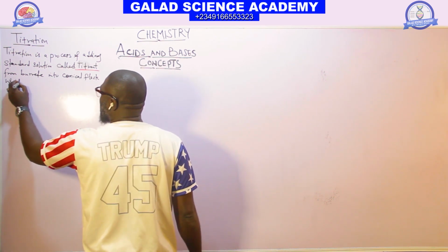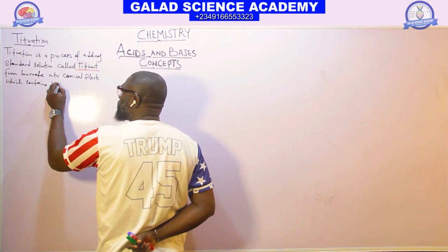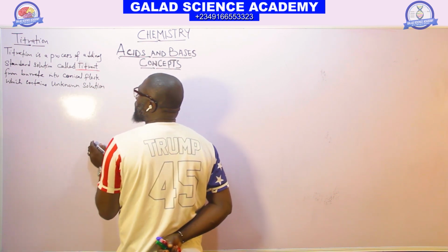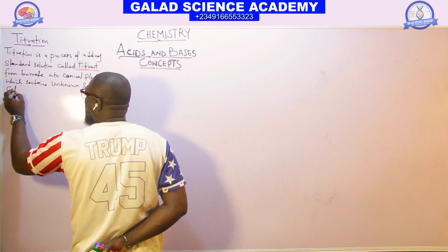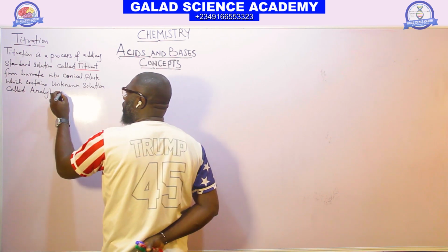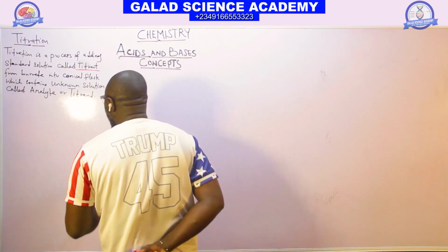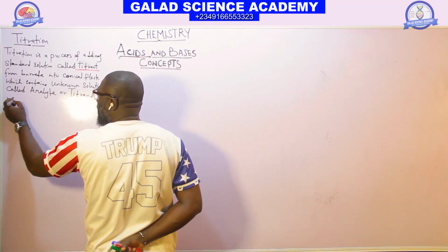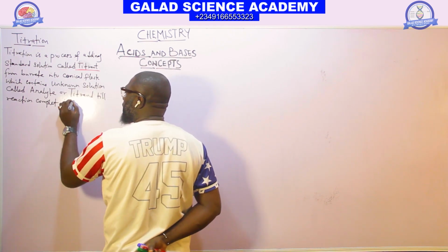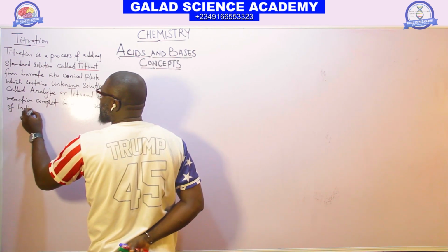the conical flask which contains the unknown solution called analyte, until the reaction completes in the presence of indicator.